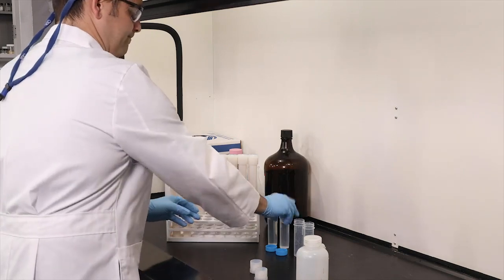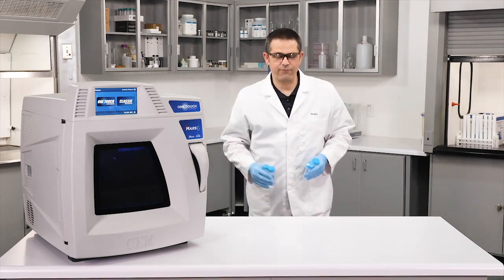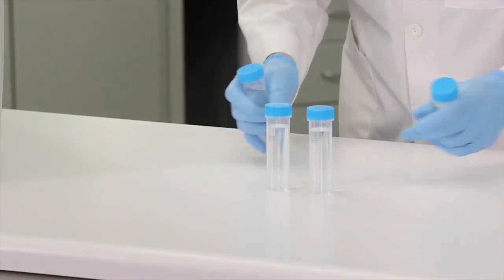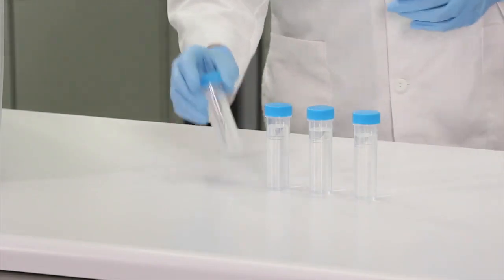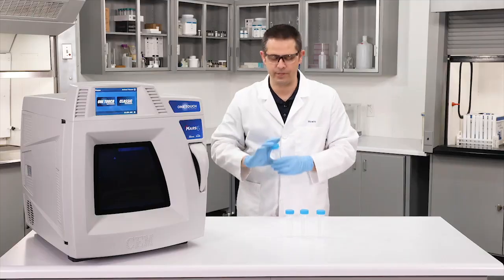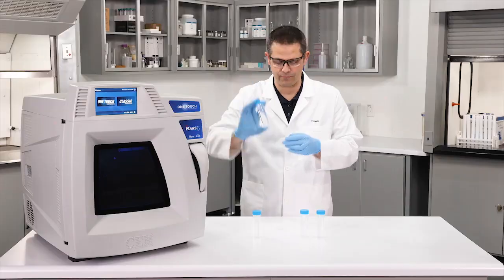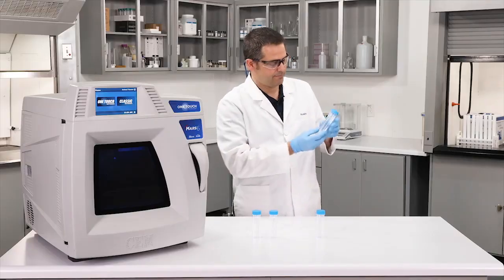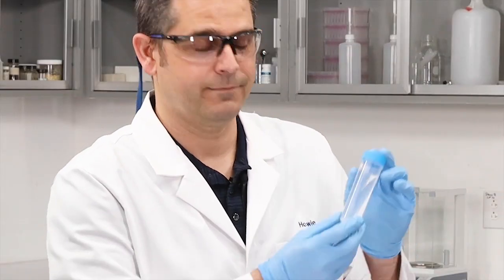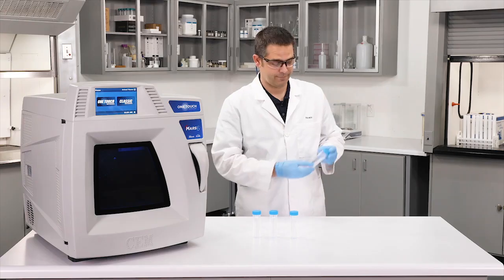Okay, so we have our four digested balls. Let's take a look and see how well we did. All right, remember the first one - this is our soccer ball. We scored a goal. Clear, colorless, particle-free. Here's our basketball. Slam dunk. Again, clear, colorless, and particle-free. Baseball - definitely hit it out of the park. Clear, colorless, and particle-free.